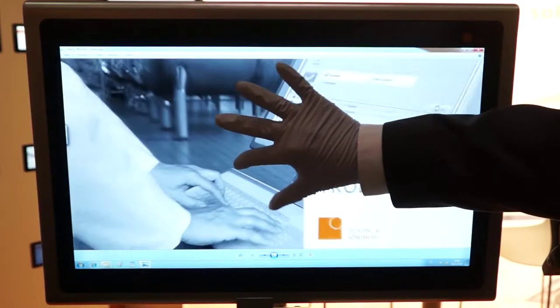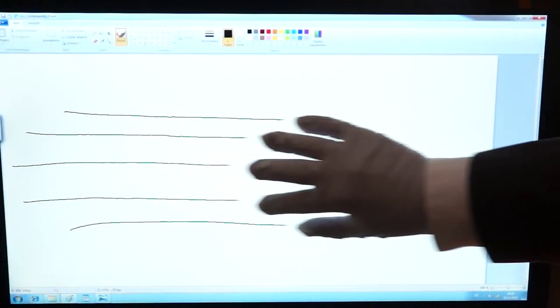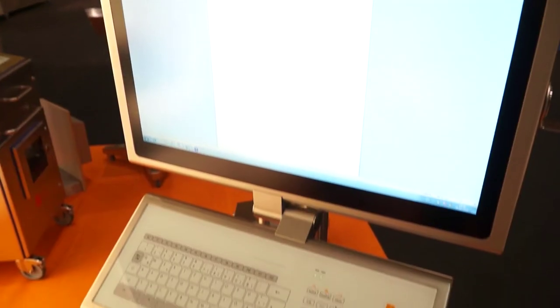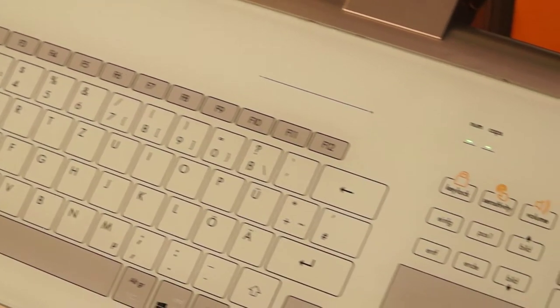The Wave is equipped with a brilliant optical bonded capacitive touch display, which allows precise multi-touch operation with up to three layers of cleanroom gloves. The stainless steel encapsulated glass keyboard attached to the Wave features a capacitive touch glass surface.